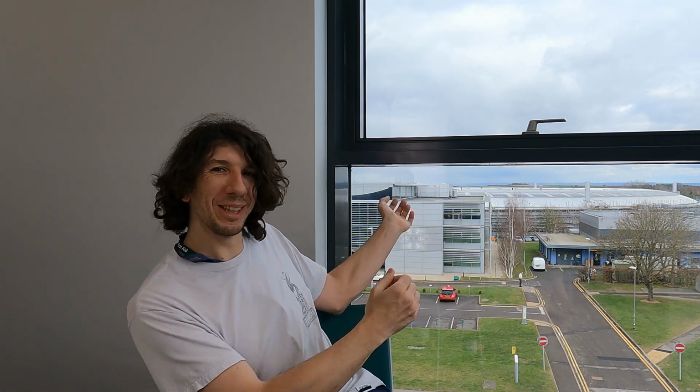You want to go smaller, we often use X-rays, like the synchrotron that you might just about be able to see in the background of me. And X-rays, they have wavelengths that are now an angstrom, which is 1/10 of a nanometer. Electrons are even smaller than that. So electrons do actually have a wavelength similar to light, even though they aren't photons.